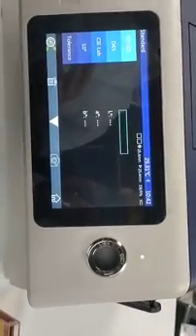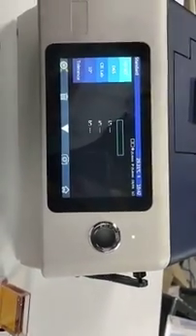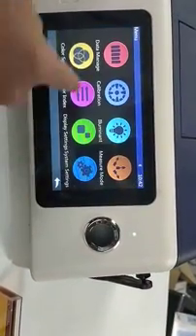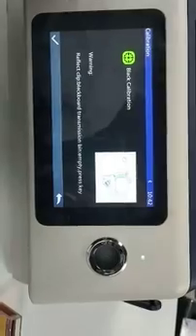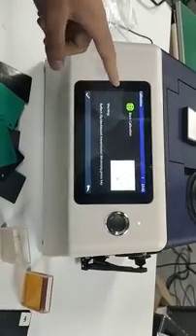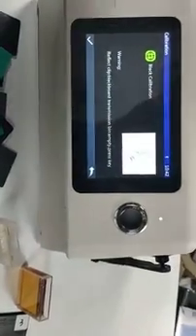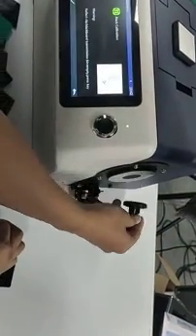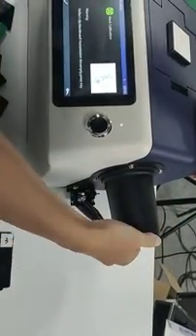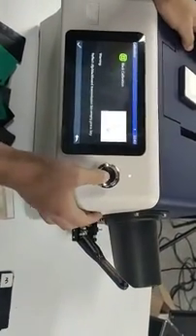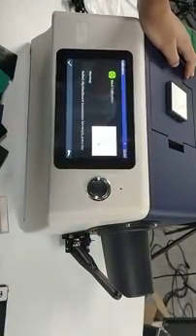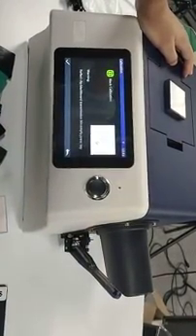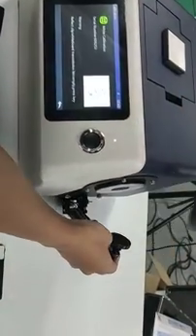First, the first thing is calibration. We enter the calibration interface. According to its prompts. First, black calibration. This is the black cavity. We enter the calibration interface. Ok. Press the button. And then white calibration.